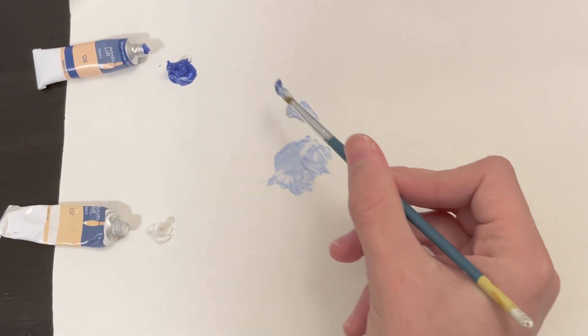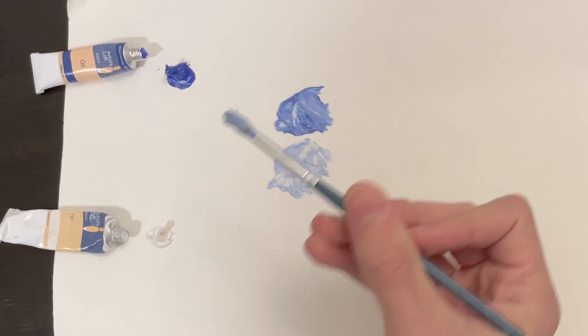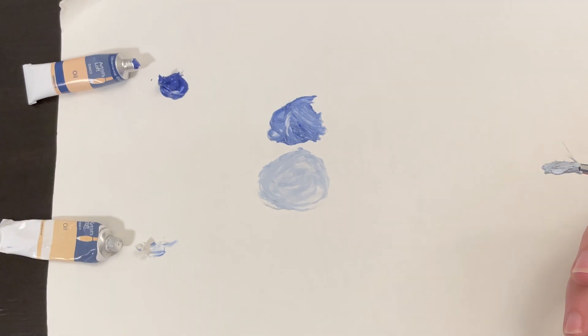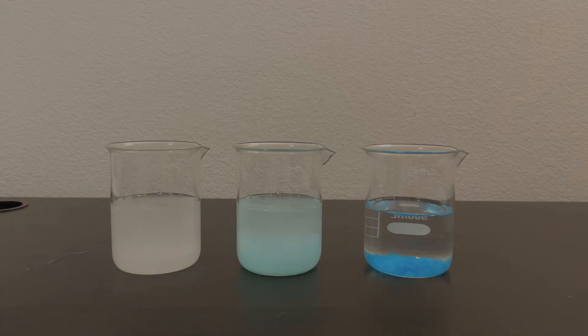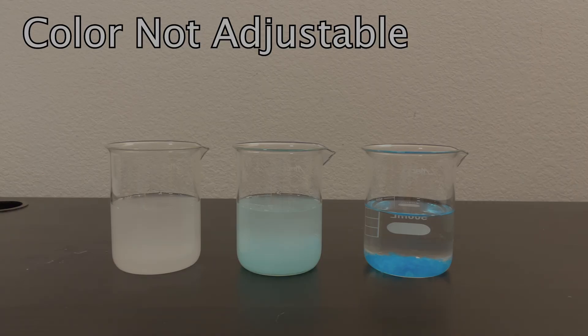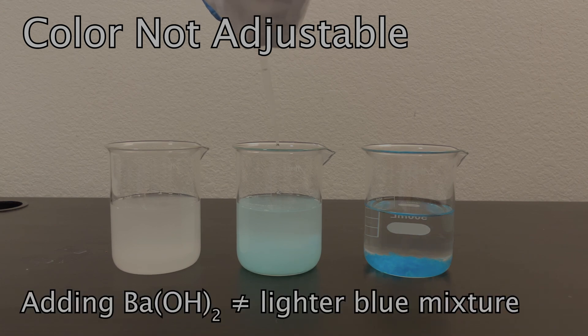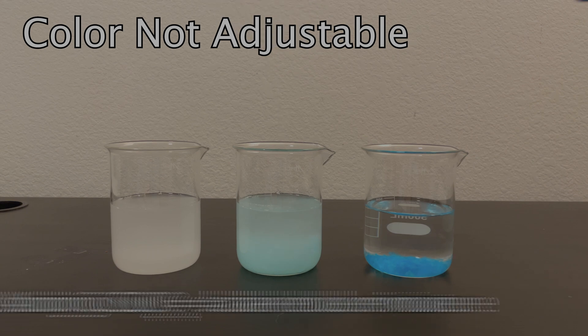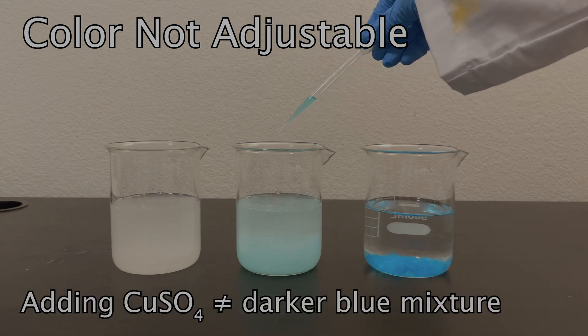But the paint analogy isn't 100% correct. With paint, I can add more blue to make it a darker blue, or more white to make it a lighter blue. But with precipitates, the color isn't adjustable. I can't add more barium hydroxide to this middle beaker to make the solid a lighter blue. Nor can I add more copper sulfate to make it a darker blue.